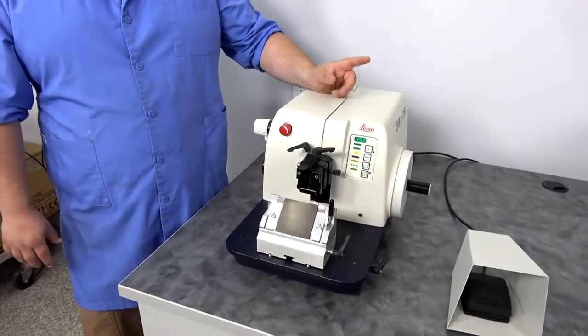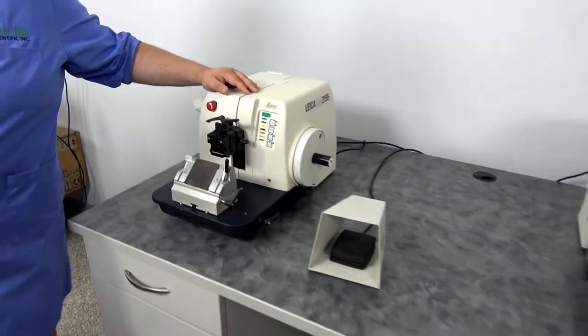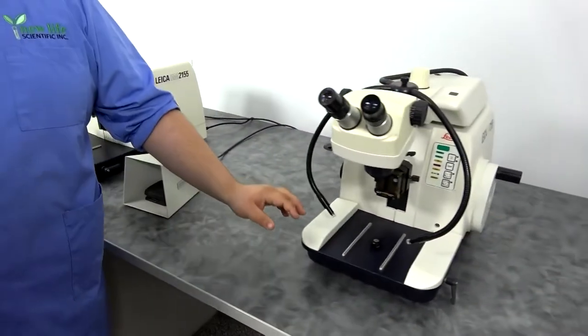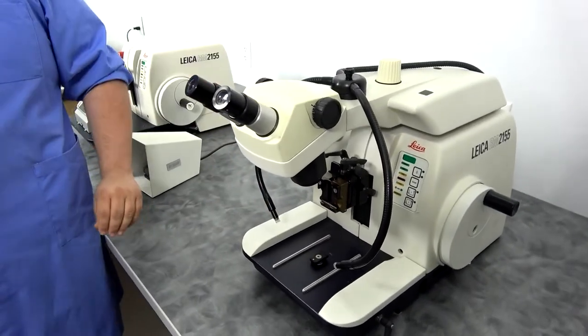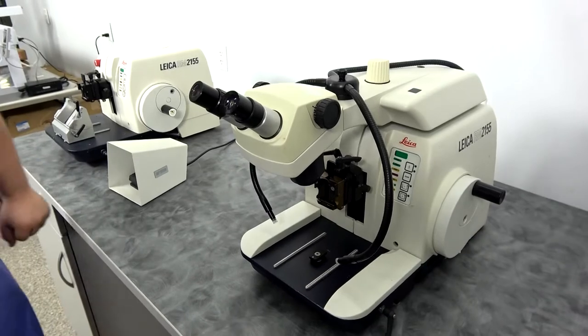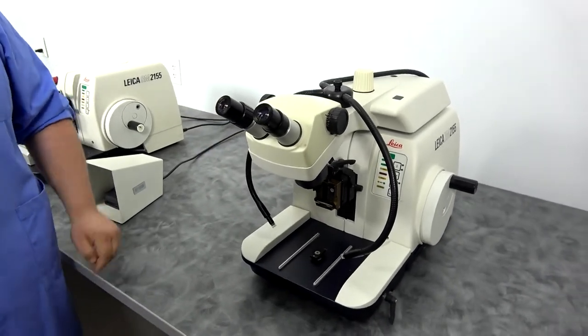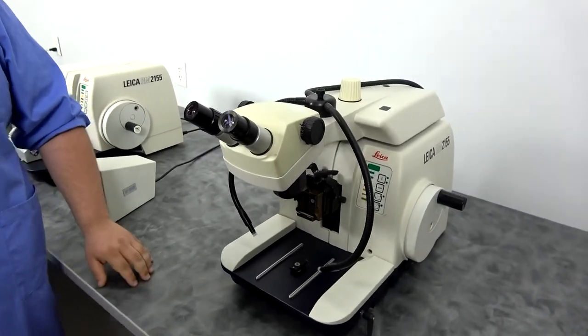We do have, coming through the pipeline off to the right, another 2155. This one does have your rests here and the microscope attachment on top. We're just waiting for a few more parts on that, and that one should be available for sale as well.